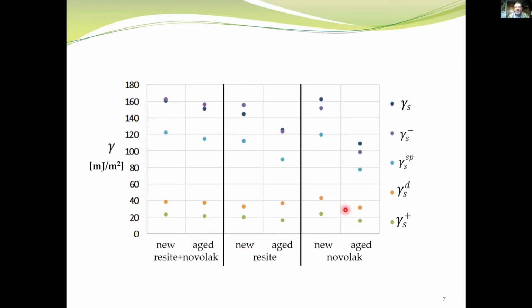As you can see, the changes of the respective parameters for Novolac are much higher, and we suggested to the manufacturer that the quality of this resin is responsible for the stability of the final product, abrasive materials.